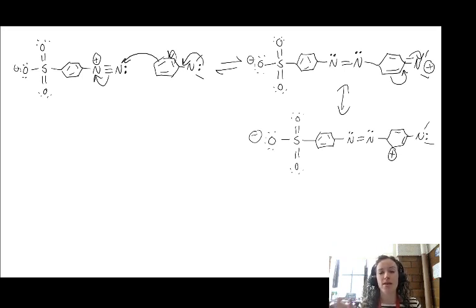And so this is the point in the reaction mechanism, or in the protocol, and if I check it real quick, where we add sodium hydroxide. This is at step 4, it looks like. We add some sodium hydroxide. We need a base catalyst to finish up the rest of this mechanism. So let's add in our beautiful base.